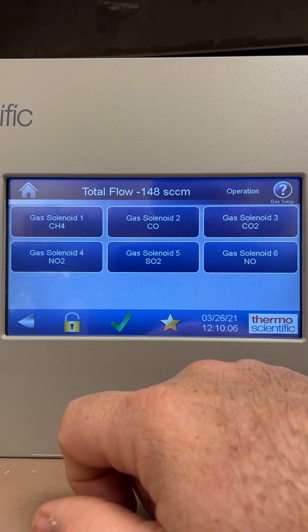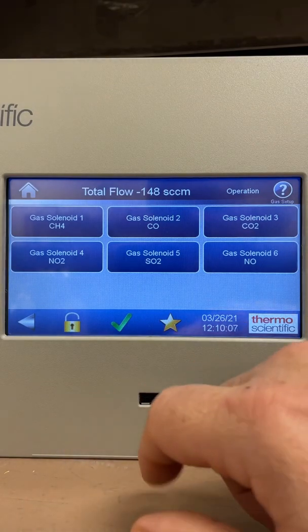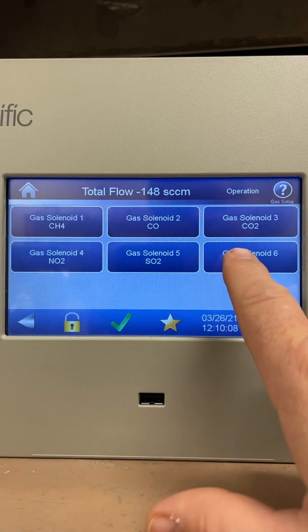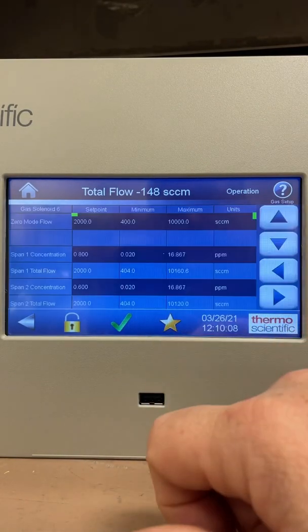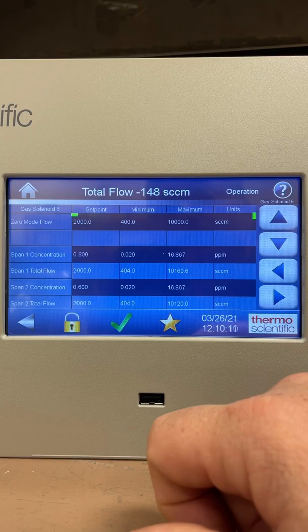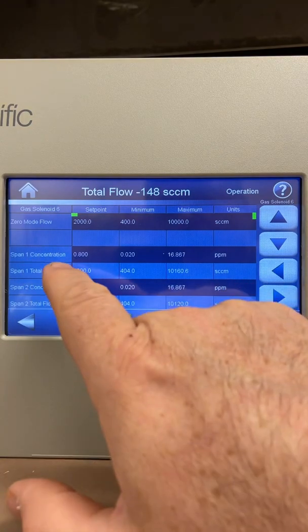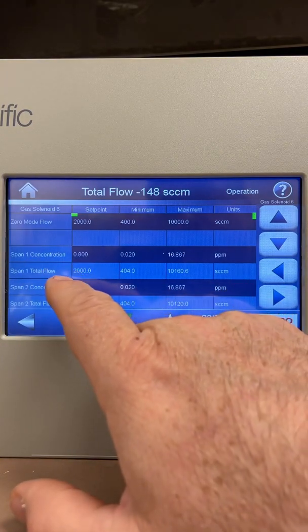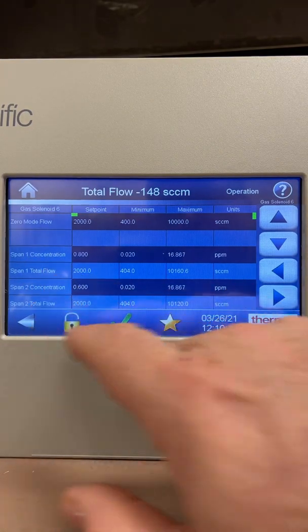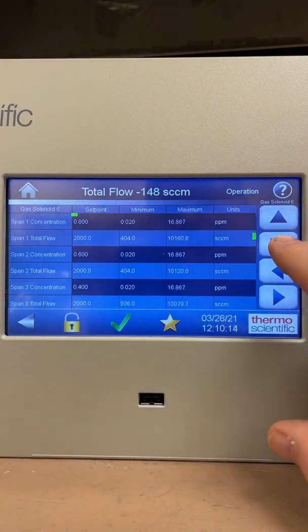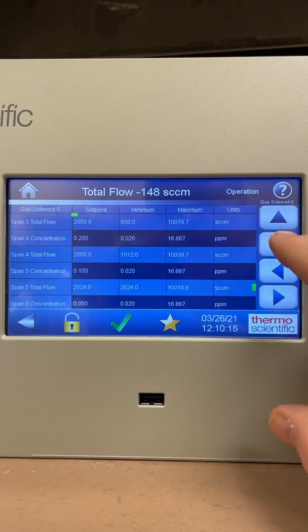There's also a gas setup screen where I set up my NO solenoid span 1 concentration, span 2, all the way down to span 6.